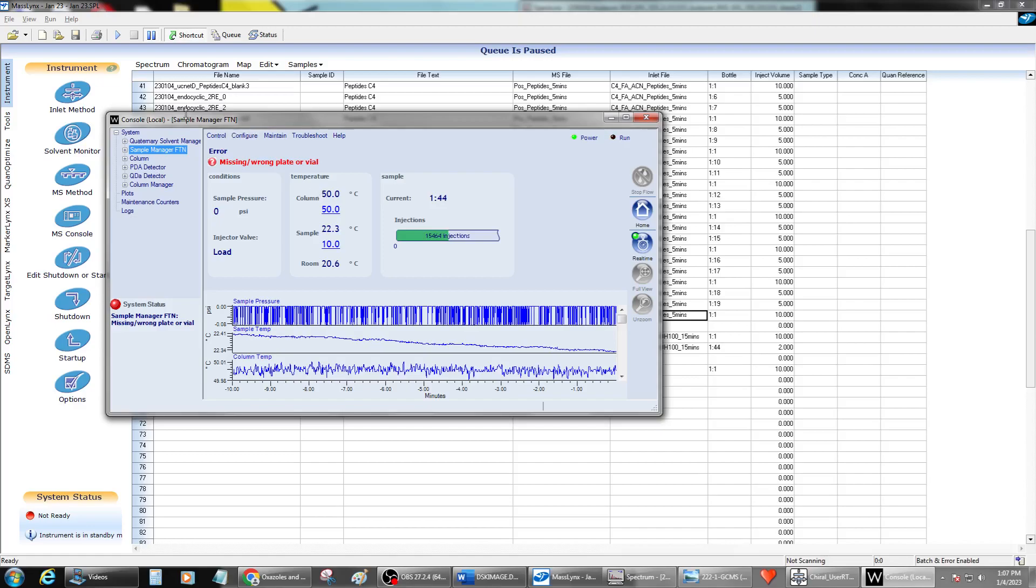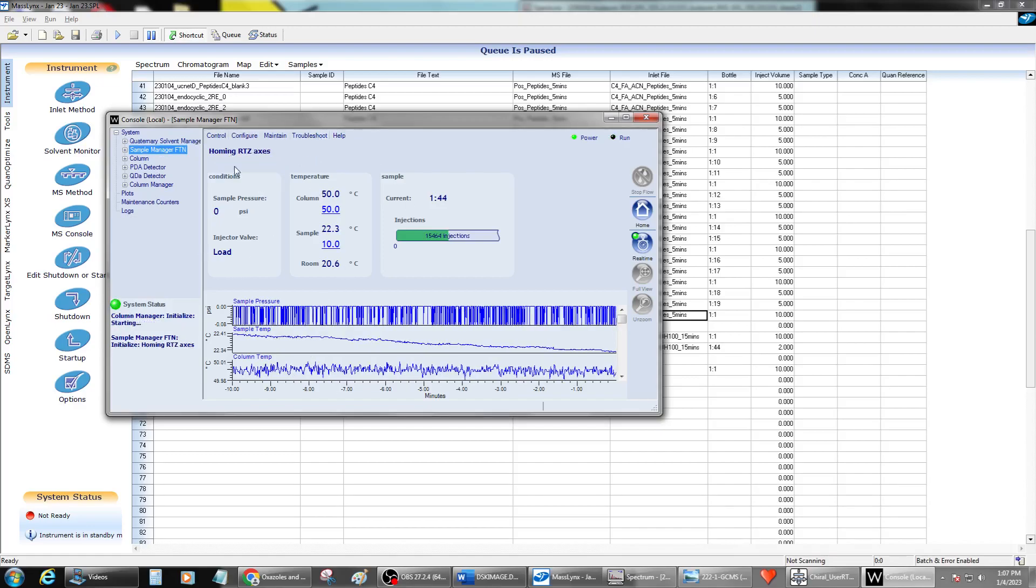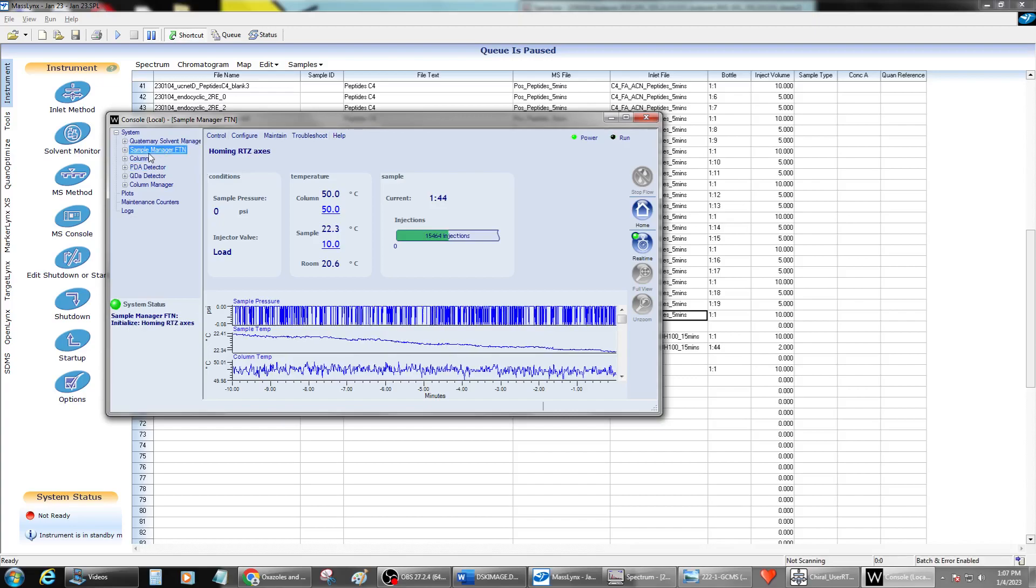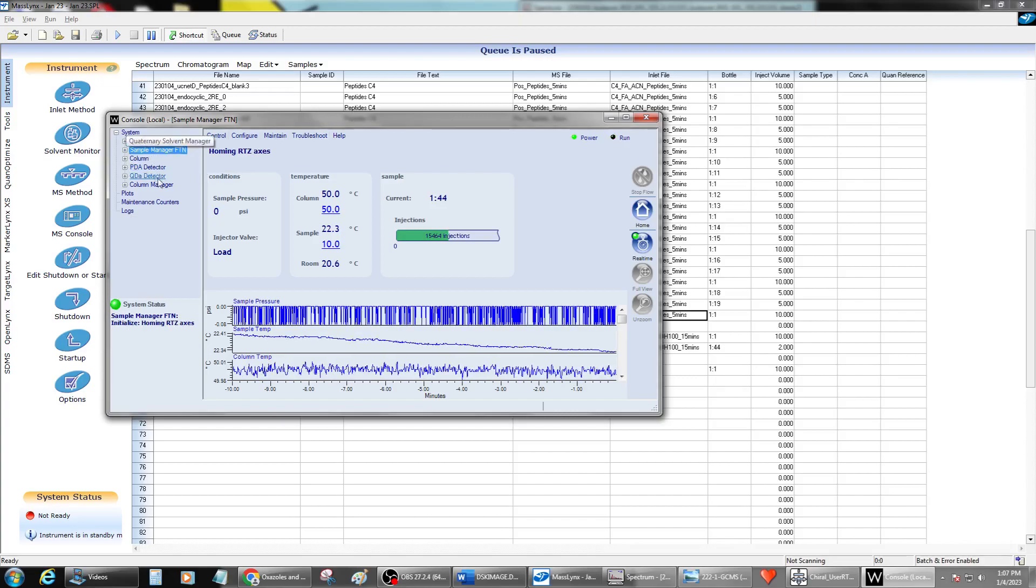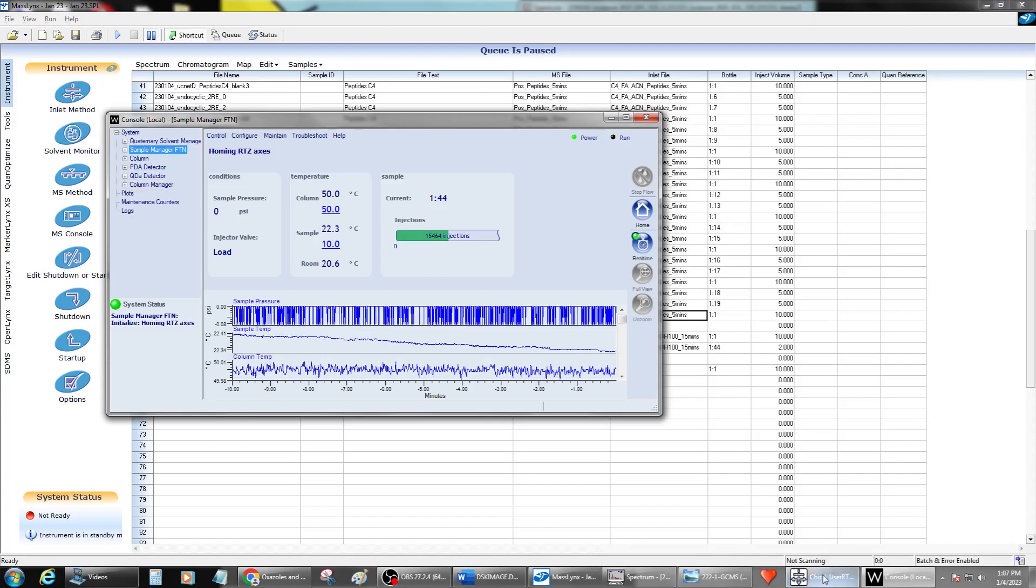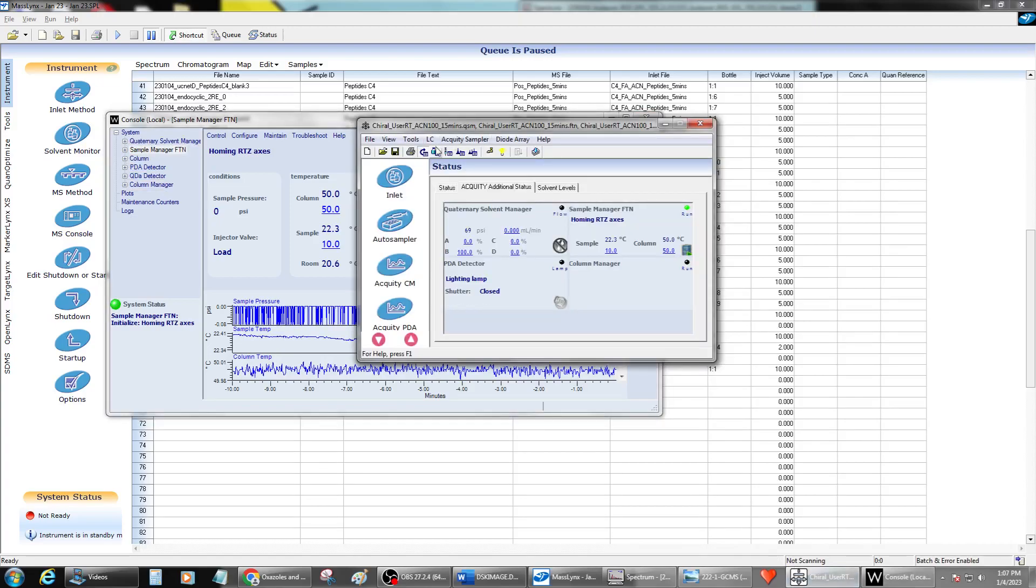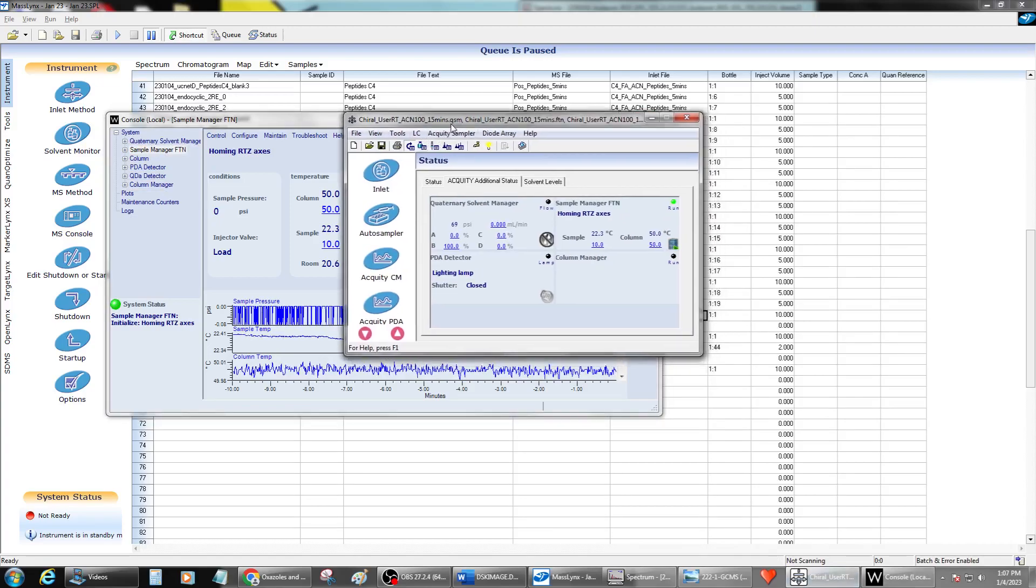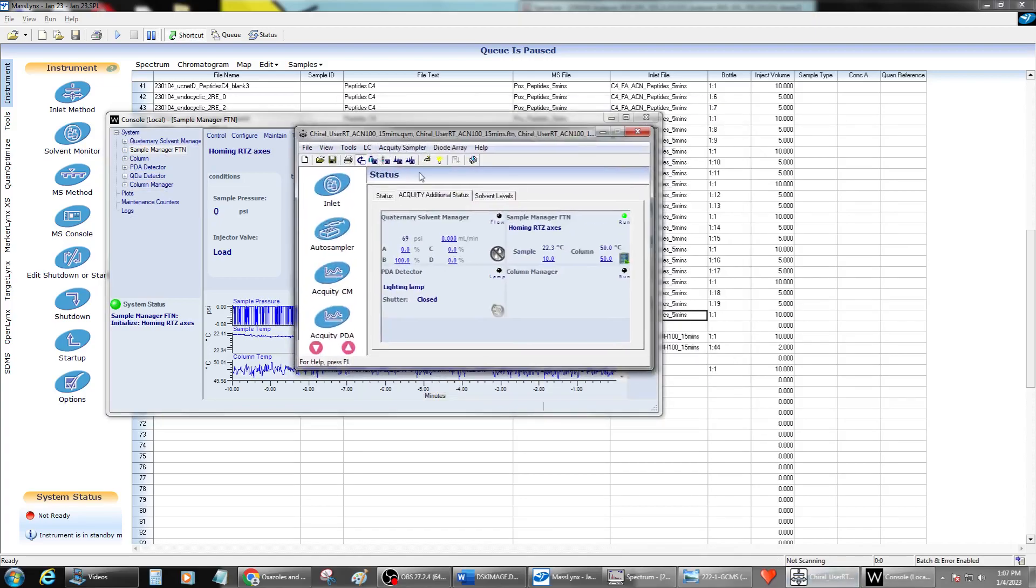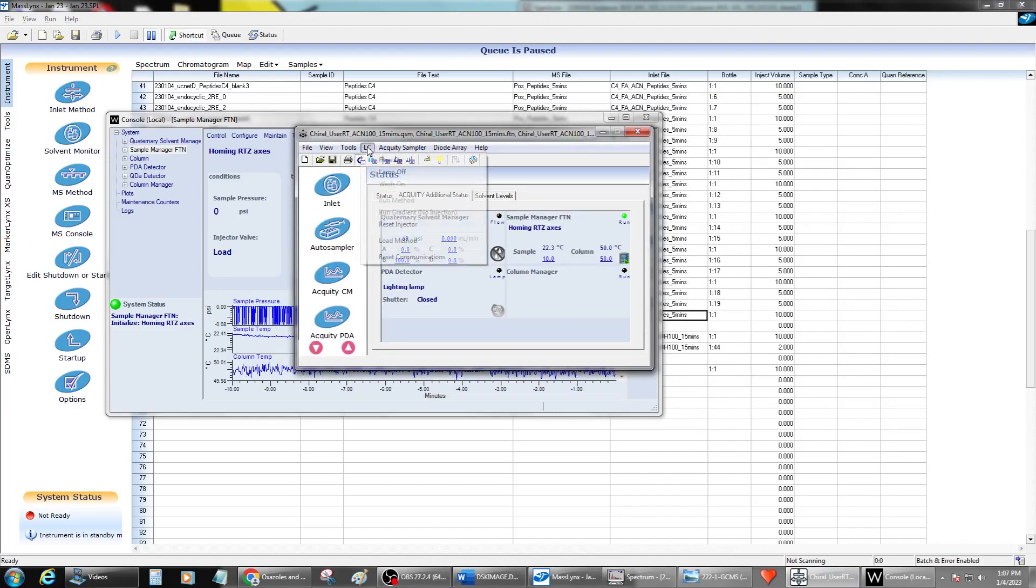All right, so that's going to go ahead and start resetting. Now anytime you reset something in the console, any of the inlet components, you're going to have to reset the communications for the entire stack and the inlet again in order to communications come back. That's at least how I do it.